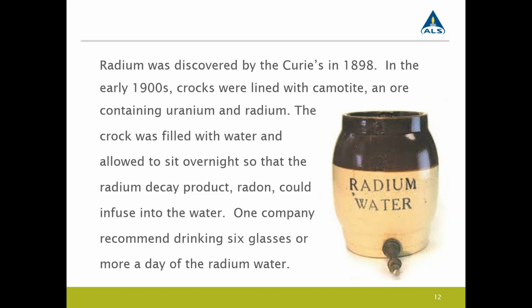But gas flow proportional counting comes in with a little bit more assumption that after that 2-week decay period, that radium that you're getting reported as is just the 226 and doesn't have any of the lingering other 223 or 224 isotopes. So our recommendation is for produced waters or drinking waters is the alpha scintillation 903.1 method.